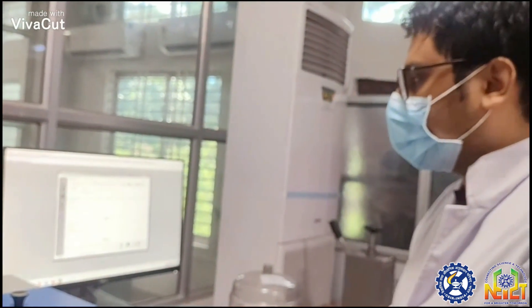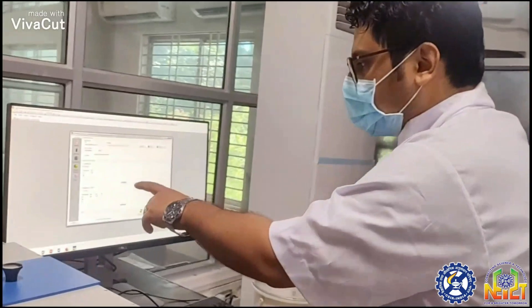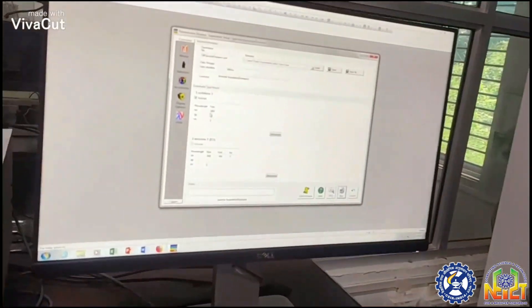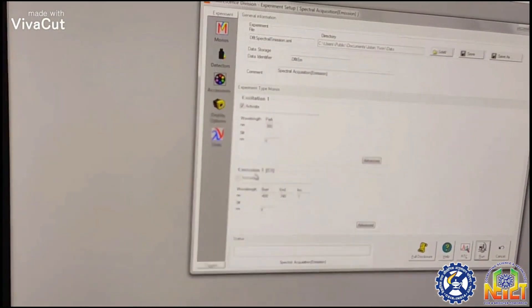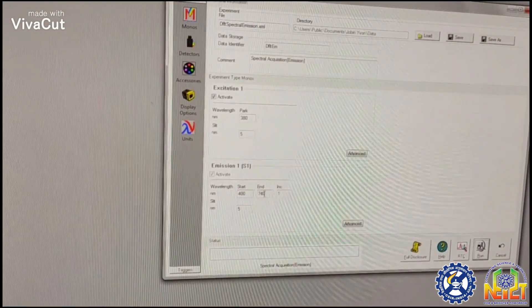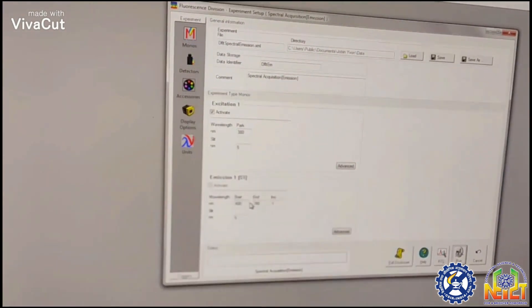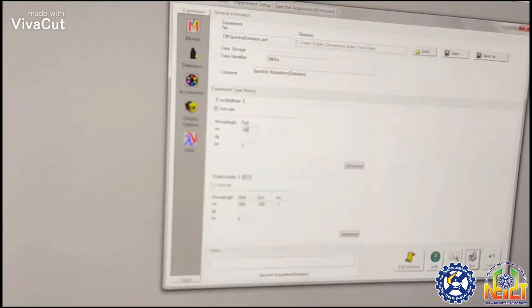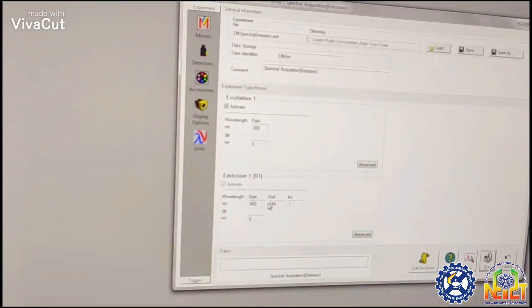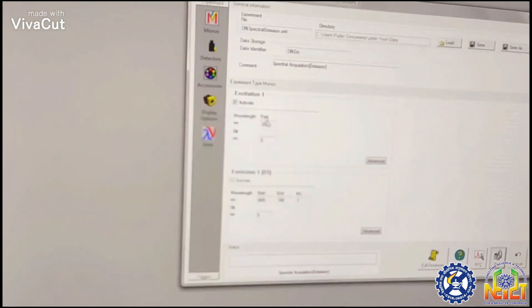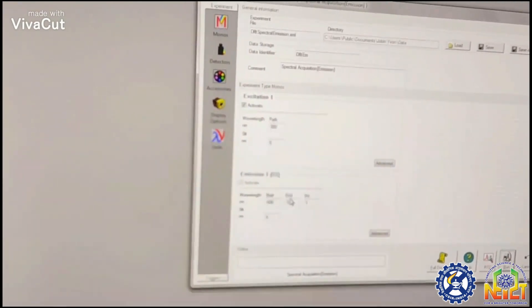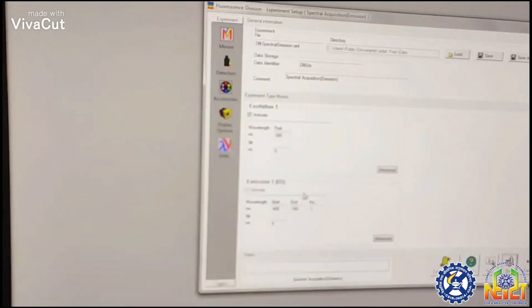We use an excitation wavelength of 380 nanometers and measure emission from 400 to 740 nanometers. This range is chosen so the excitation light is outside the emission spectrum by 20 nanometers, and also avoids the second harmonic optical peak by 20 nanometers.